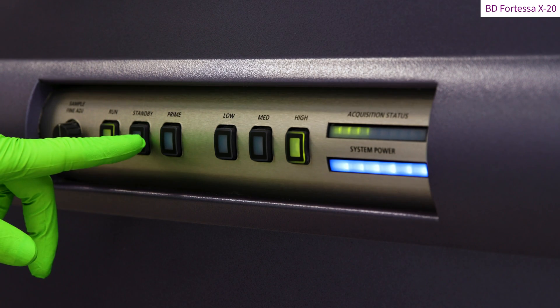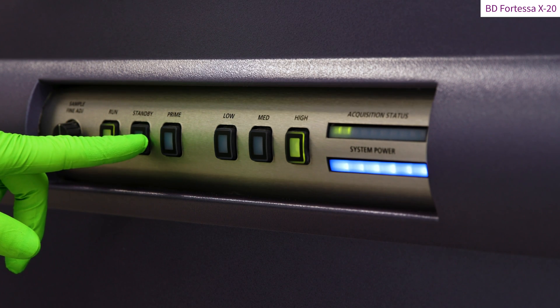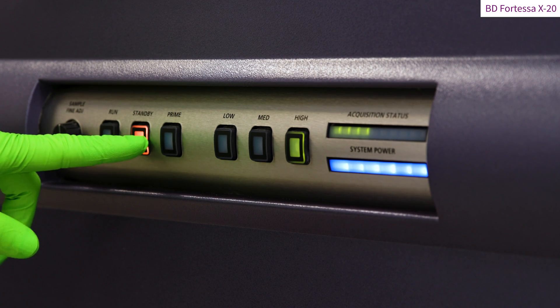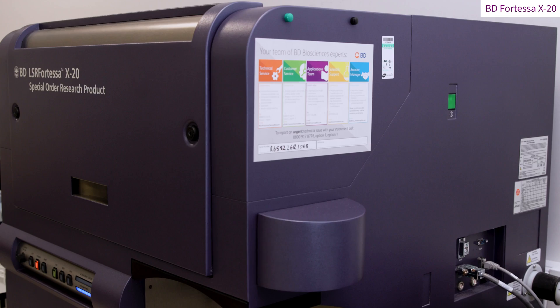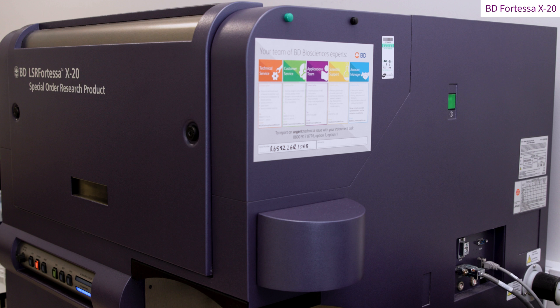Using the instrument fluid control panel, press Standby. If you were the last user today, the Fortessa can be switched off by the main power switch located on the right hand side of the instrument.